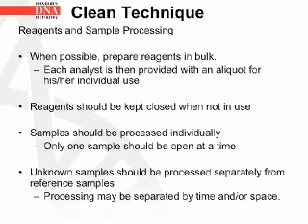We will now go over the clean technique with respect to reagents and sample processing. When possible, prepare reagents in bulk. Each analyst is then provided with an aliquot for his or her individual use. Reagents should be kept closed when not in use. Samples should be processed individually. Only one sample should be opened at a time. Unknown samples should be processed separately from reference samples. Processing may be separated by time and/or space.